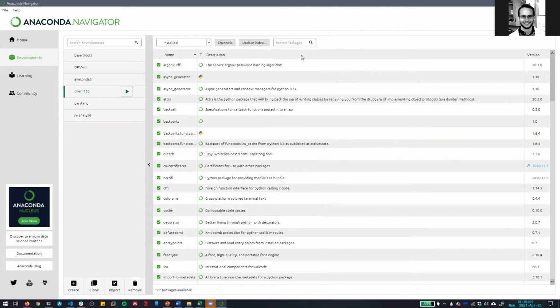So just out of curiosity, is anybody at this kind of screen yet and has an environment kind of loading, got a blue bar going here, or it's already done? Richard, you have an environment already created? Did you install some of the packages that we need? No worries, Valeria. I know it'll take time depending on, like I said, your Wi-Fi. It's a pretty big package.